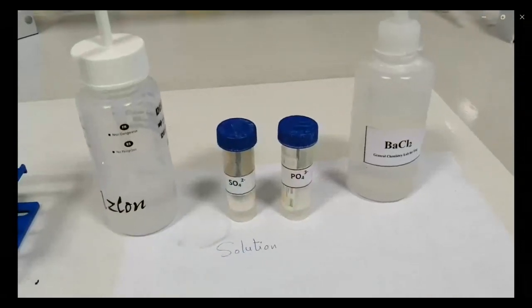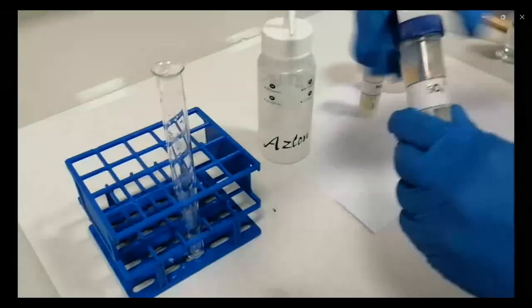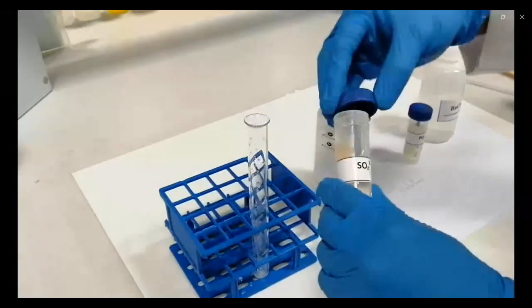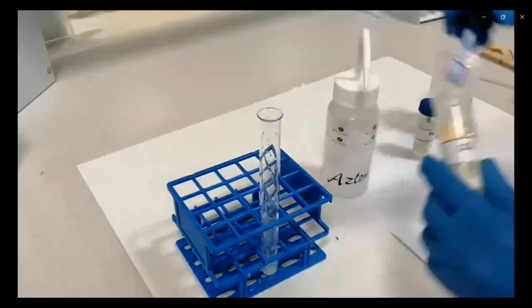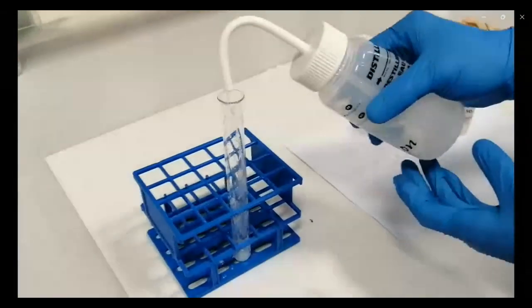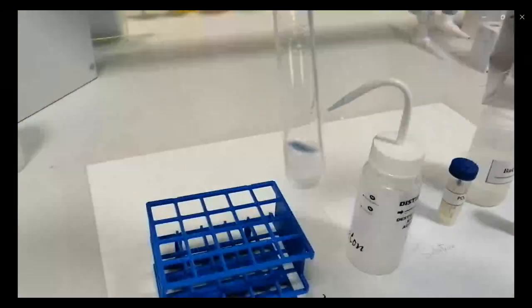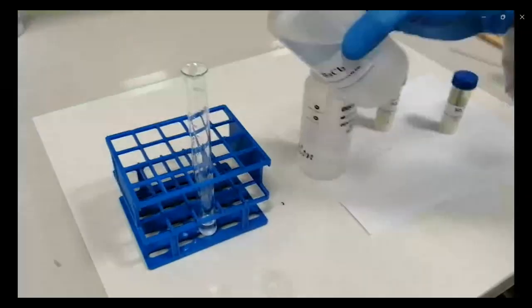Great. And then go to the second confirmation test, which we are going to do using the barium chloride chemical reagent. Just prepare a solution of sulfate first by mixing the salt with water. Then add water. Then add barium chloride.